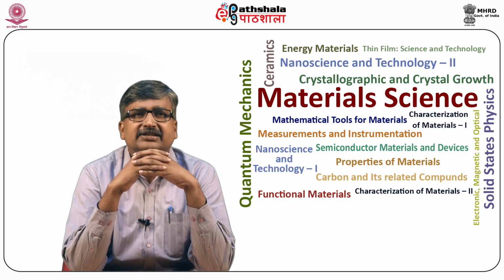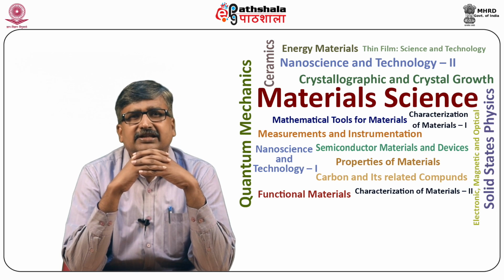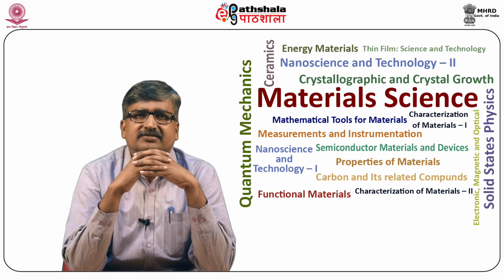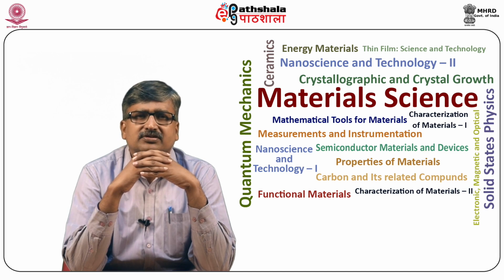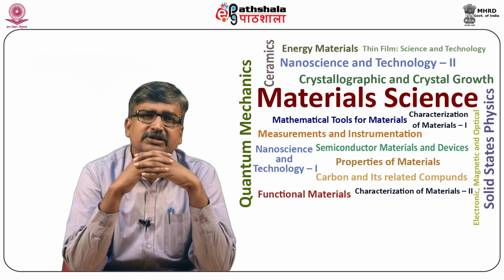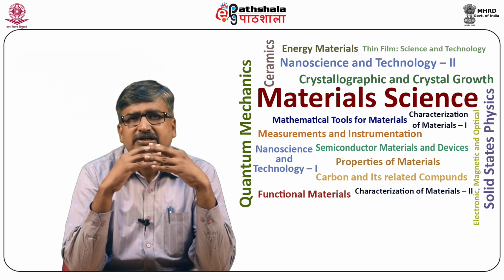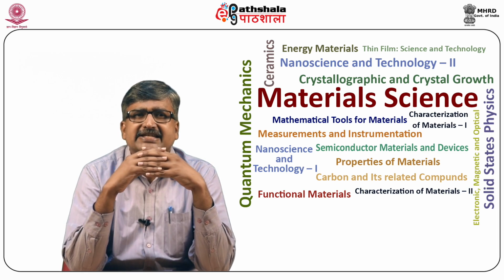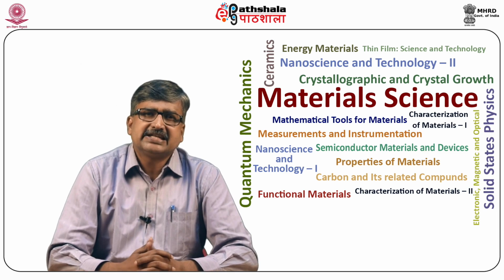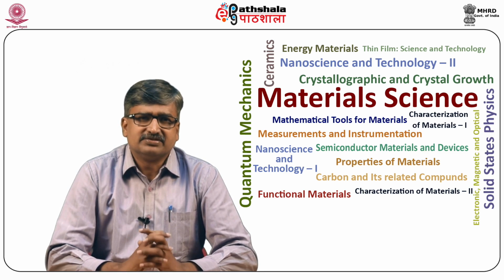In little over 2 decades, capillary electrophoresis, known as CE, has emerged as a powerful analytical technique for determining the chemical composition of mass-limited samples. It enables rapid separation with high separation efficiency and compatibility with small sample volumes. CE has been used for a variety of applications, including determination of inorganic ions, environmental, food, and clinical analysis, peptide and protein separation, single cell assay, and DNA sequencing. The state of the art of CE is addressed in several recent reviews.